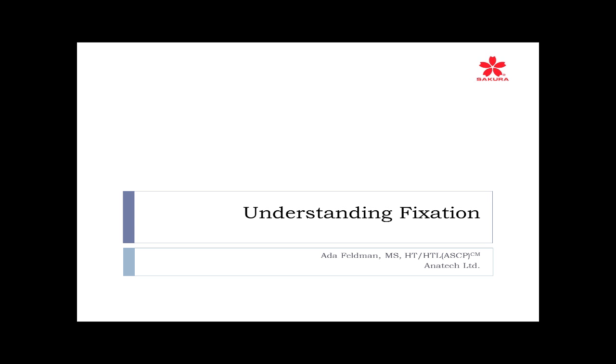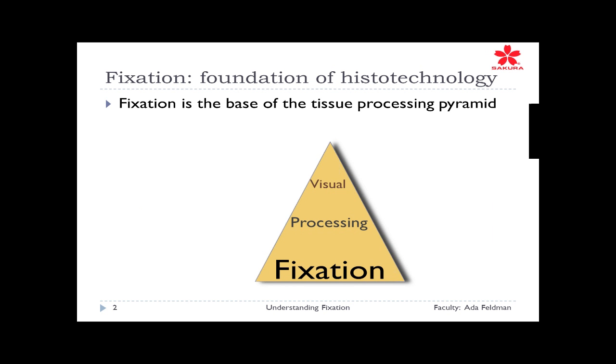The topic is understanding fixation. Everything we do in histology is dependent upon this one word called fixation. And therefore, understanding it is of the utmost importance. While it seems like a simple little word, I think we're going to find today how complex it can be.